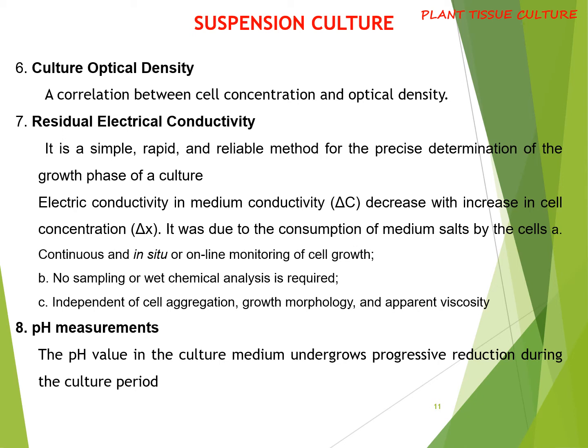The electrical conductivity in the media decreases with increase in cell concentration. It is due to the consumption of the salts and nutrients in the media by the cells. This method is independent of cell aggregation, growth morphology, and viscosity of the media. Major advantage is no sampling is required.